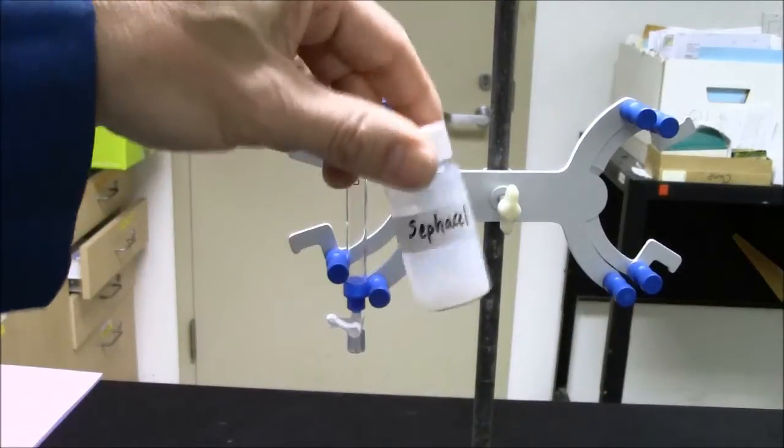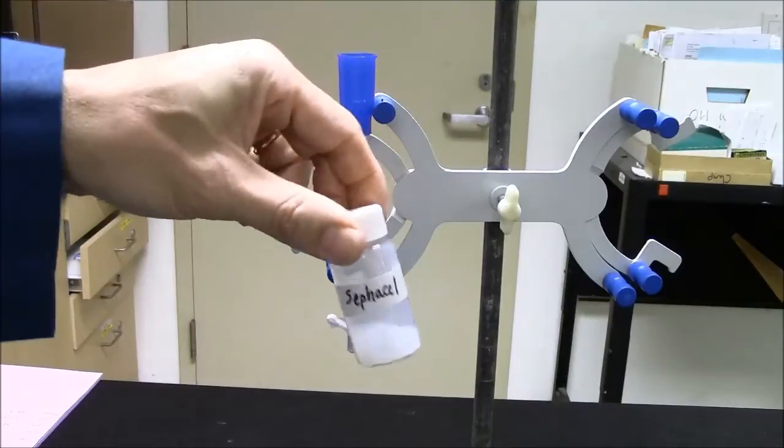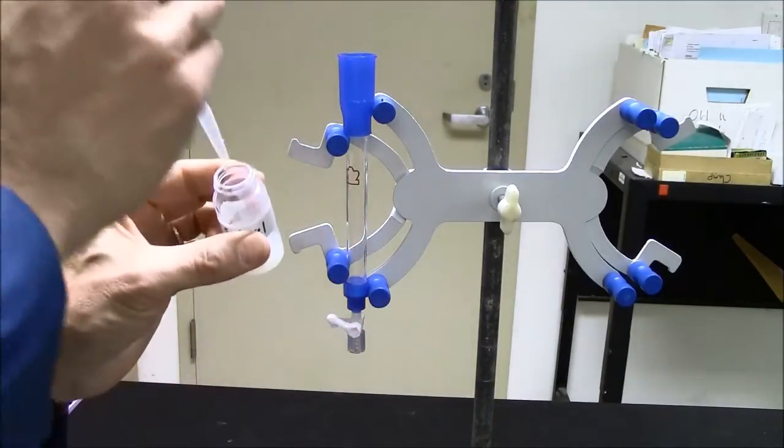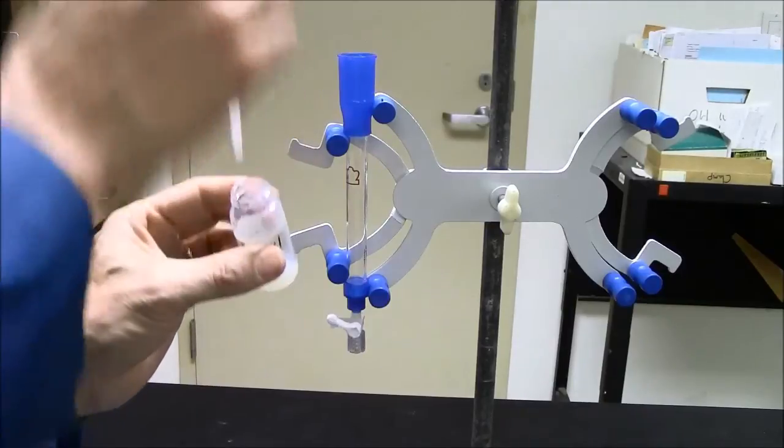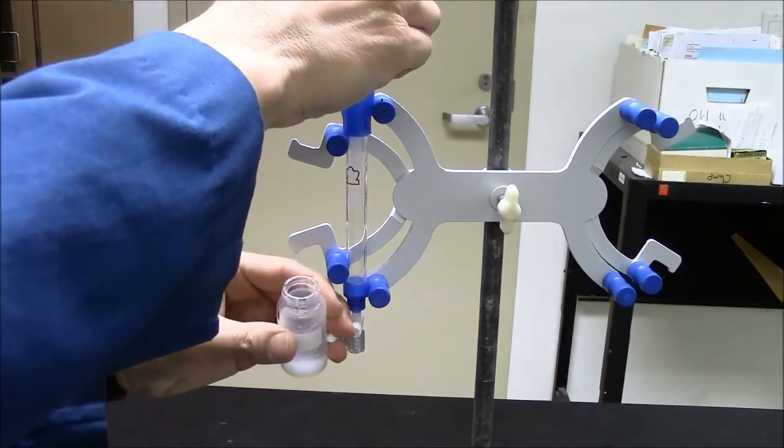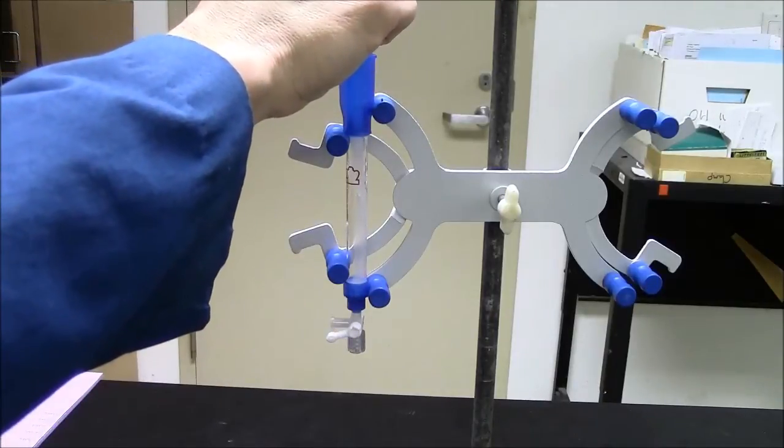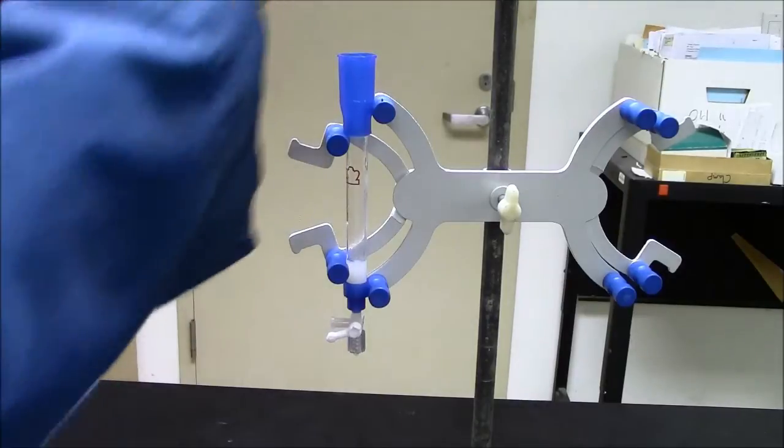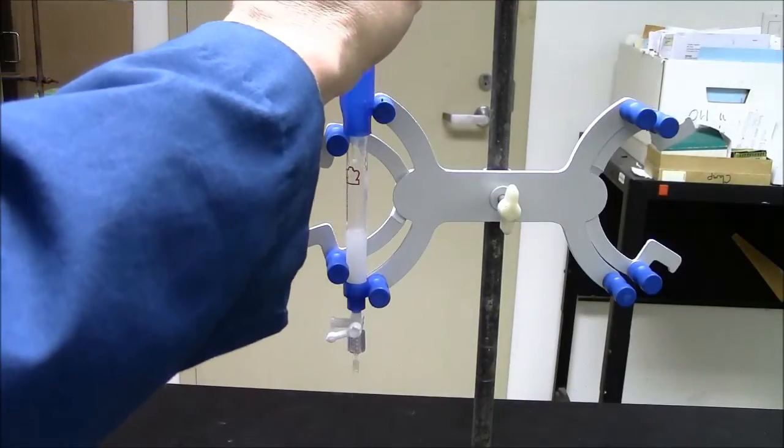To load my gel, I'll first swirl my gel to get it suspended, and then I'll take my sawed-off pipette and add to the column. So I'll start with two pipettefuls, and then I'll see what I have.